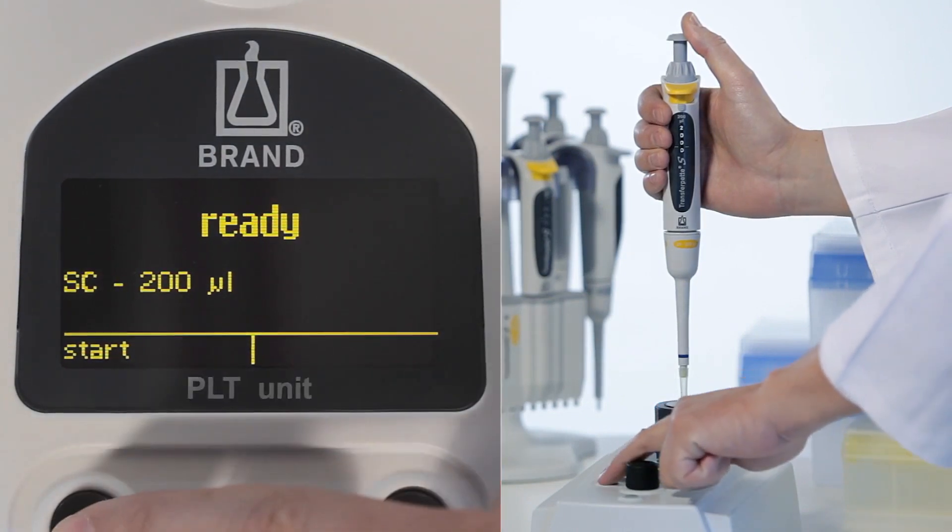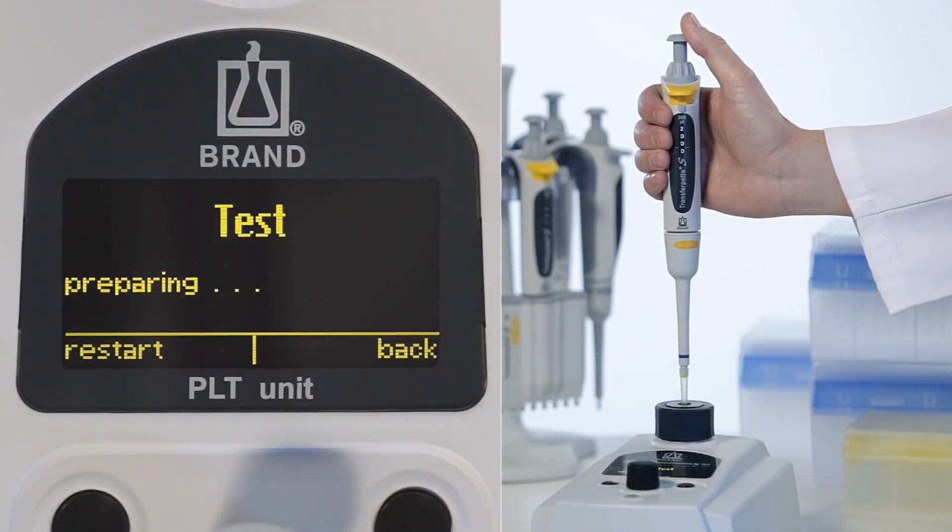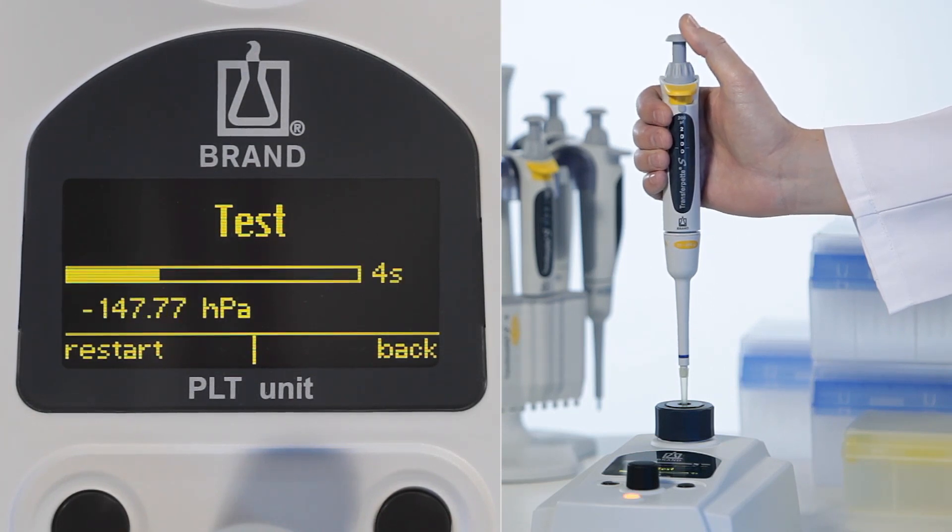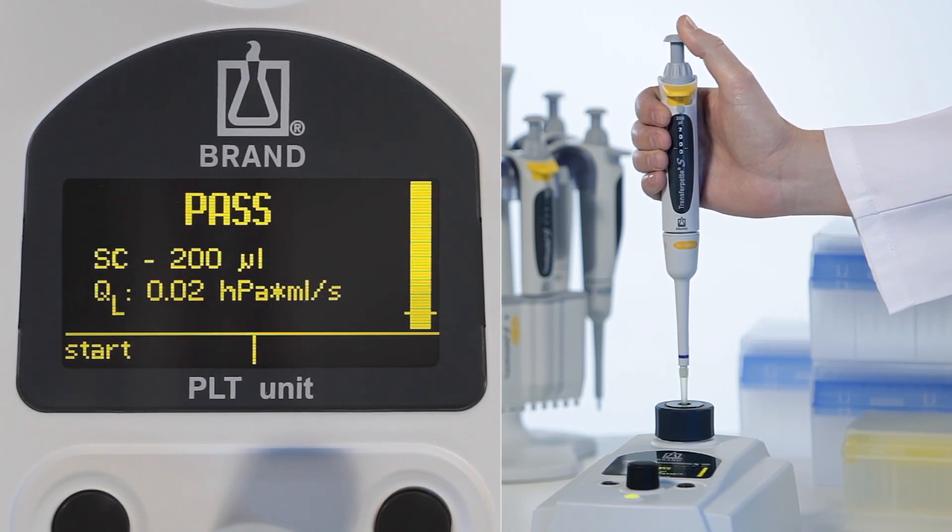We now test a pipette with a tip attached and press down the pipetting button several times during the measuring phase to detect possible problems with the piston. Testing shows that the pipetting system is leak-tight.